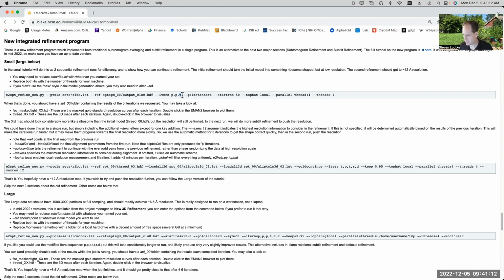This is the key step in achieving high resolution in subtomogram averaging. This is the one key thing that all of the different packages that do high resolution subtomogram averaging now share, and it is what allowed us to move beyond 15 angstrom resolution and get decent resolutions in our results: doing this so-called subtilt alignment. Now this is a translational alignment only.